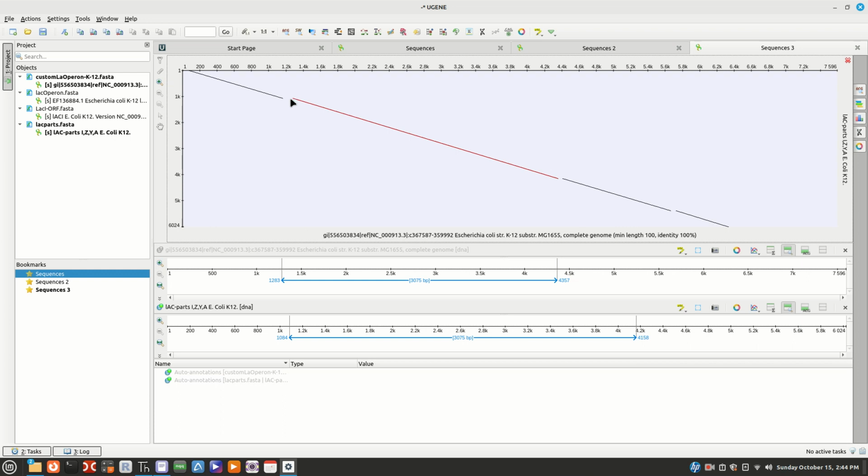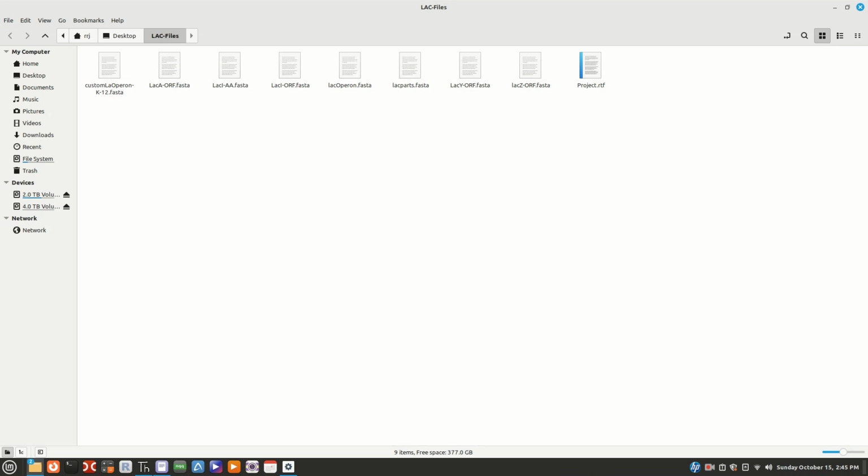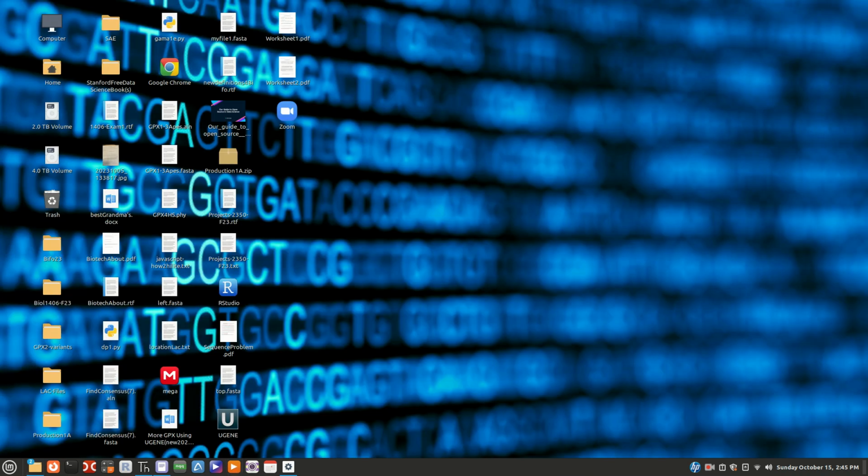You could even go and search on NCBI and just grab those separately. But I would grab them, and I would grab a little bit more on each side, just a little of the others, keeping in mind where they are. So I would probably grab that, and grab this piece right here, and then compare it to what you've already done, just to make sure you know where everything is, know where this one starts and this one ends, and then work on it there. Then you would do it here, find where one begins and one ends, and work on it there. Kind of what we've already done in previous videos where we were looking at everything.